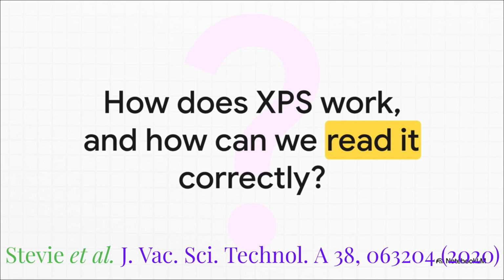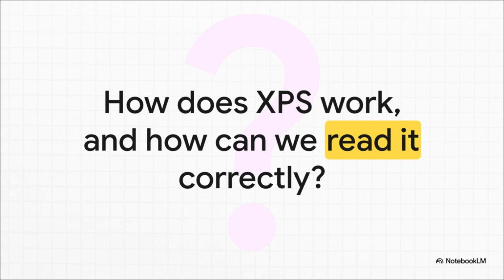So that's exactly our mission for this explainer. We are going to build an analytical blueprint so you can really master XPS. We're going to start with the absolute bare bones physics and then build our way up step by step so you can confidently decode those complex charts and graphs these instruments spit out. You ready to dive in?